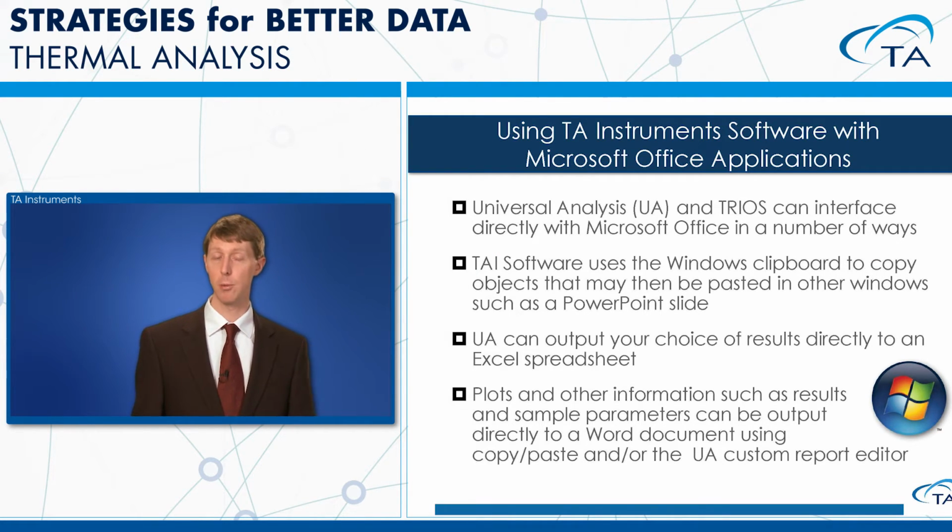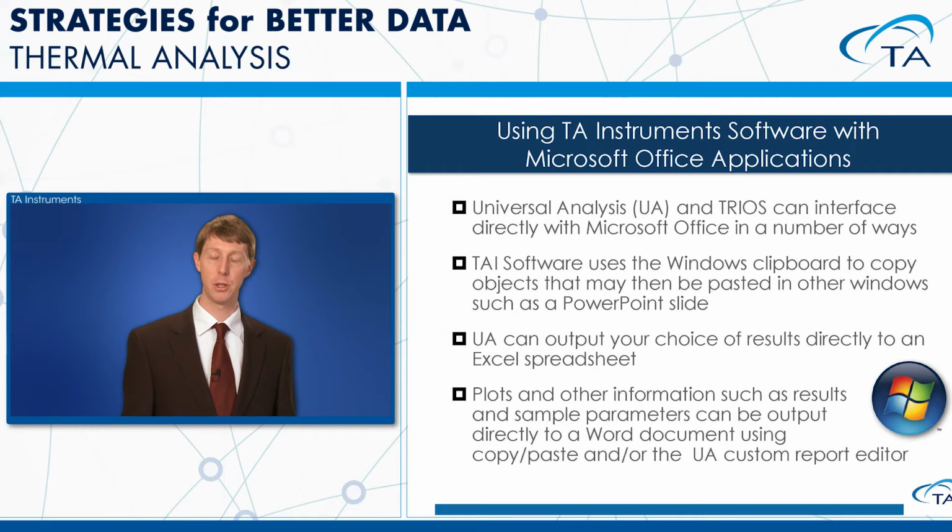And so the software that we use for all of the TA Instruments equipment is fully compatible with a lot of other Microsoft Office applications. I mean, obviously you can take plots, copy them, paste them into PowerPoints, paste them into Word documents so that you can present them that way. But there are also a couple other tools that incorporate the results that you might collect from a particular plot and throw them into Excel so that you can do some post-analysis, copying and pasting results and using them in some other application.